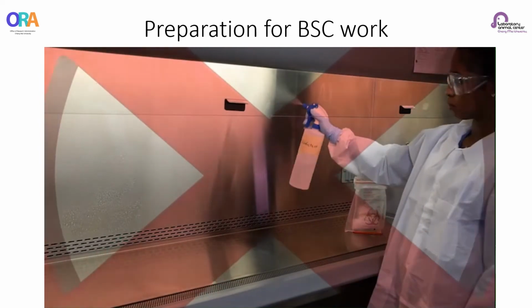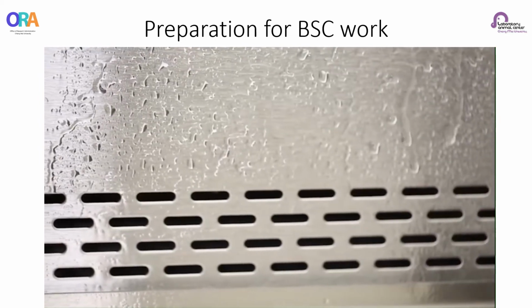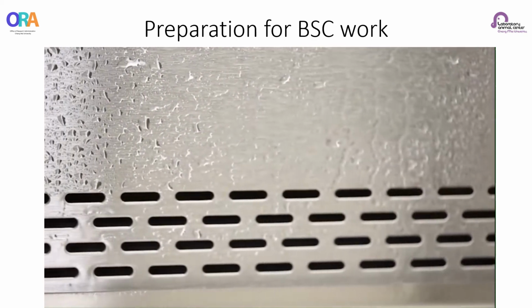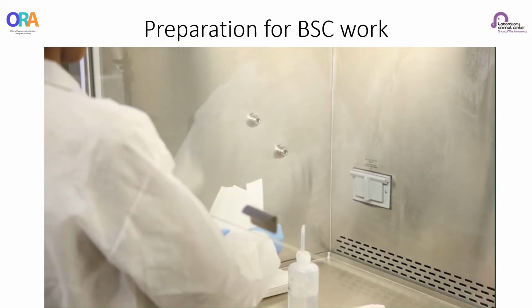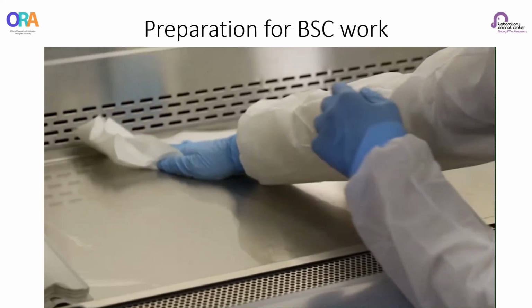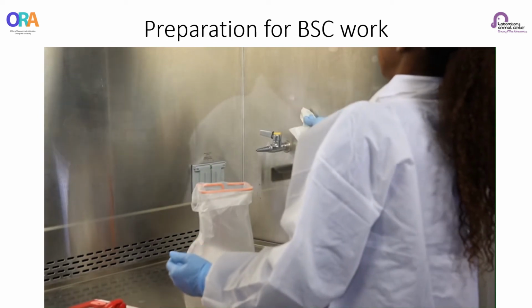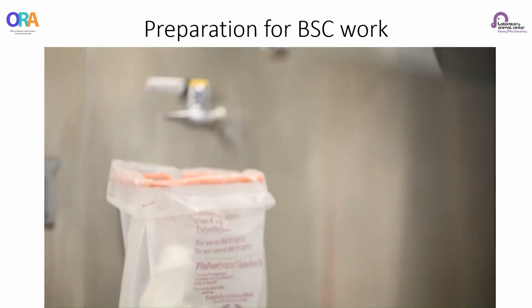It is not recommended to spray disinfectant inside the BSC because the mist can be drawn internally into the grills or HEPA filter, and this can cause pitting of the stainless steel parts inside the BSC, or it can cause damage to the HEPA filter. It is better to generously moisten the towel and wipe the surfaces, allowing enough contact time for the disinfectant to do its job. Contact time will vary depending on what is being used. Discard the used towels into the biohazard waste bag.